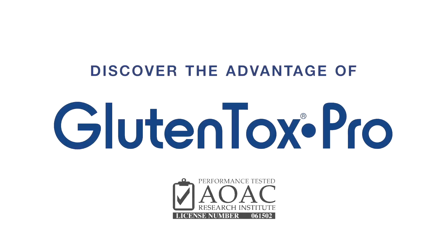Welcome to Hygiena's instructional video on GlutenTox·Pro, an AOAC certified gluten test kit.